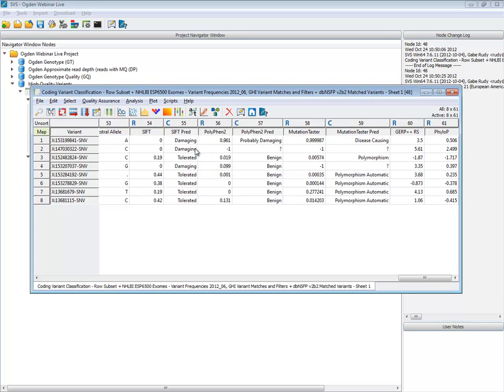Just to give a feel for what's going on, the second variant is predicted as damaging, but doesn't have predictions on the other two. So a number of reasons why. Again, there's a lot of annotations that go into these predictions, but you can also see the other variants that were higher frequency are predicted as benign, tolerated, although you can see again that these things never necessarily line up on all predictions. This one has a different prediction based on SIFT and PolyPhen.